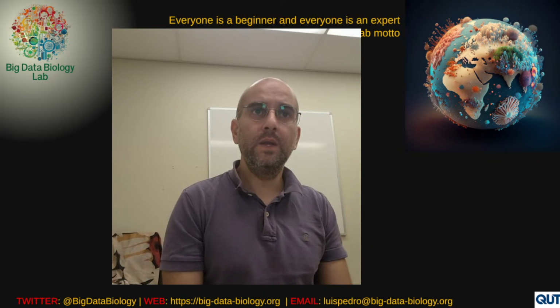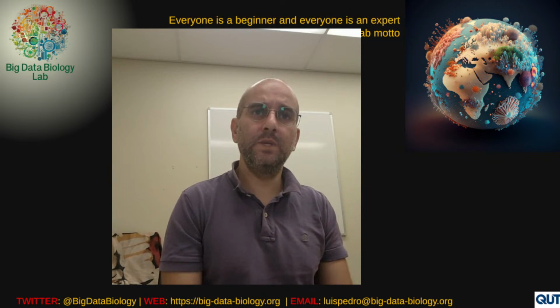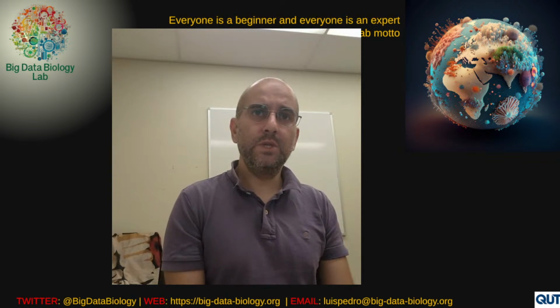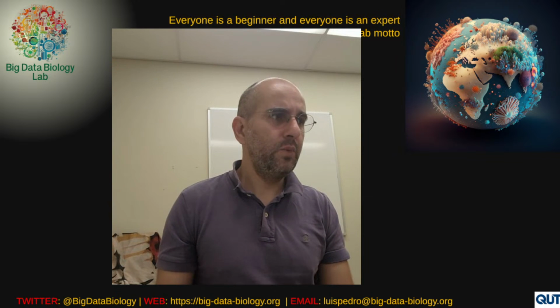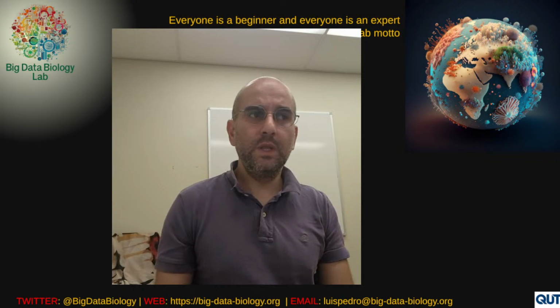And so the first trial we had done of that didn't work so well, because we had simply downloaded the GMGC and then ran Diamond on it, which probably would have worked eventually, but it just took too long and it was a bit flaky. So I decided to use Jug to do this a little bit differently.